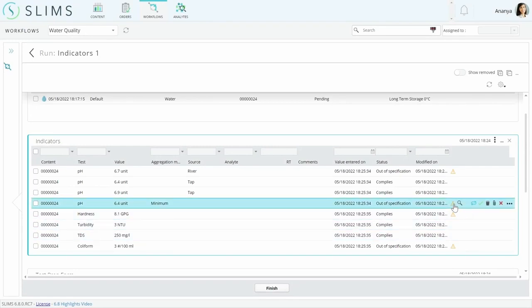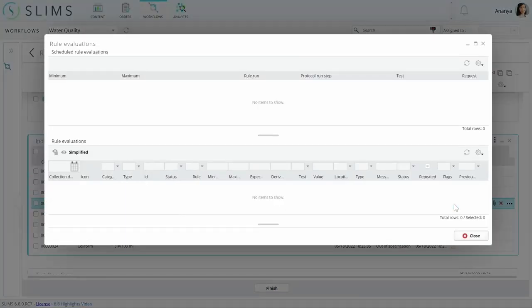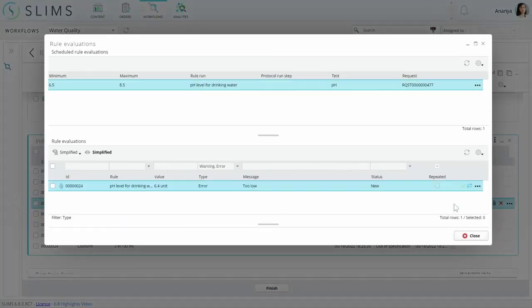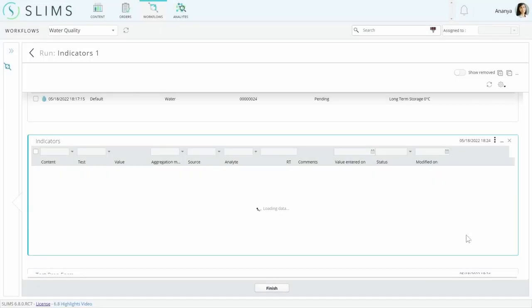Minimum aggregated results were added with this release to take the lowest value and provide feedback based on the specification. There's also a maximum aggregation method that does just the opposite.